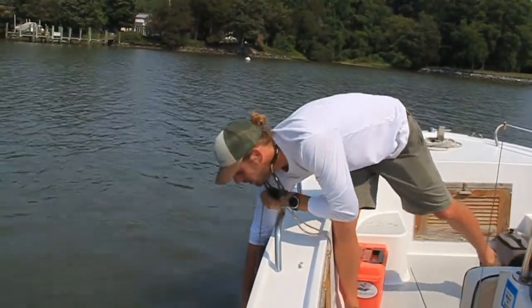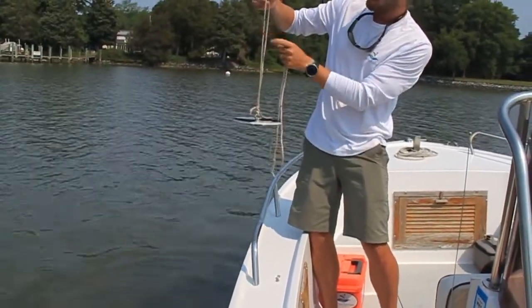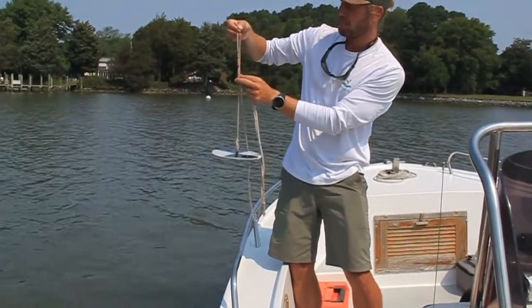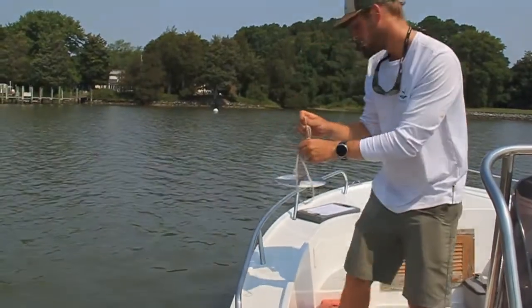Go ahead and pinch it off the water there, and then we measure here. Here is a 1 foot increment. Here's our 2 foot increment. So we're just below 1.5 feet. So we'll call that 1.4 feet of clarity, and that we'll put on our data sheet.